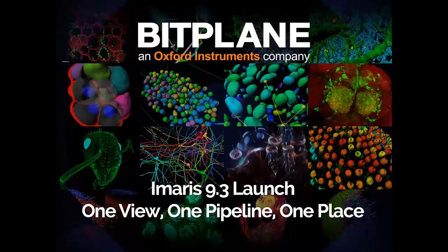So today I'm going to take hopefully about 45 minutes to go over the new things in Imaris 9.3 and to tell you about how we got here, why we got here, and what it can do for you.